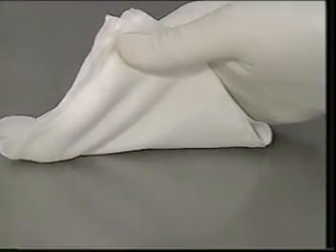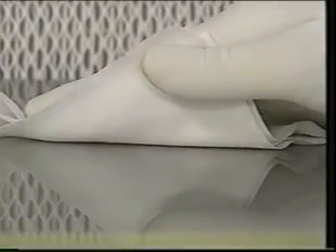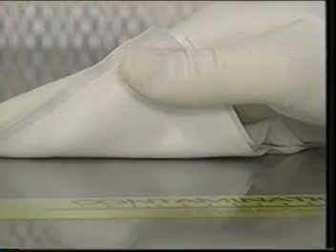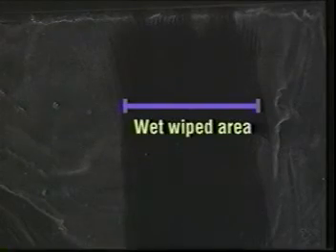Of course, there's a significant difference between the exterior of an automobile and a cleanroom surface. The cleanroom surface looks clean, even before wiping. Yet you're still faced with the challenge of having to remove potentially harmful sub-micron-sized contaminants that are too small to see. Wipers contact particles with strong forces, removing particles that cannot be blown off the surface, such as those that were deposited on this glass slide. Dry wiping removed some, and wet wiping removed virtually all of these particles.